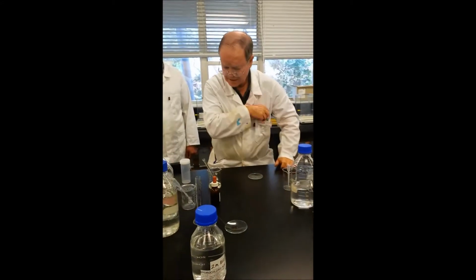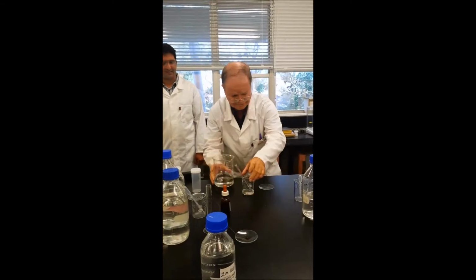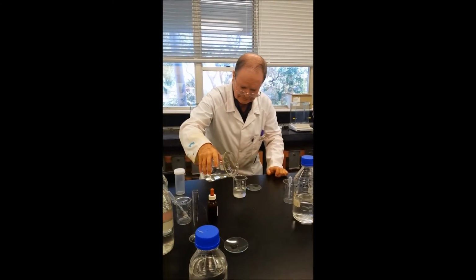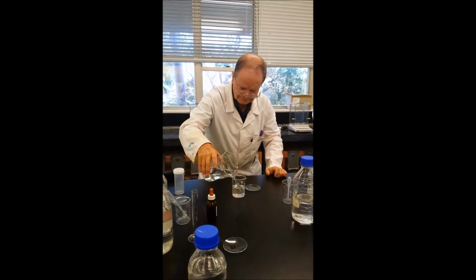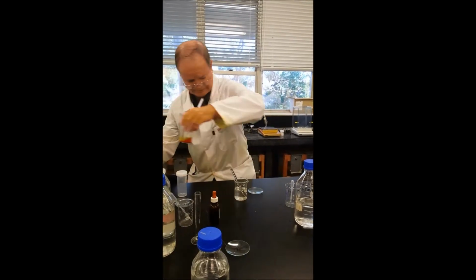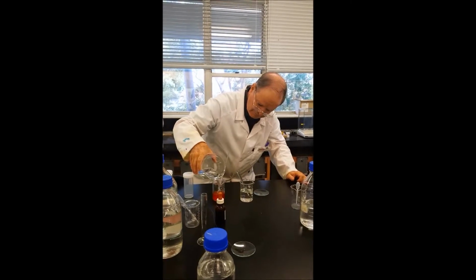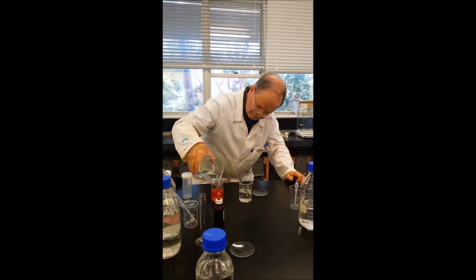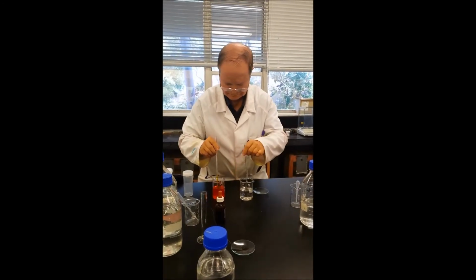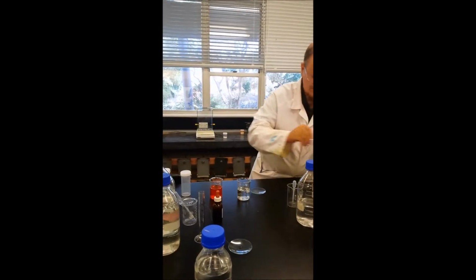Okay, now this is the phenolphthalein. Make it up to 100 mils. Okay, here's the methyl orange. Make it up to 100 mils. Take these out. Rinse them off.